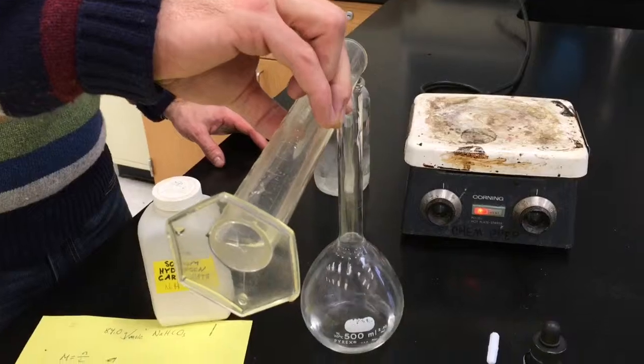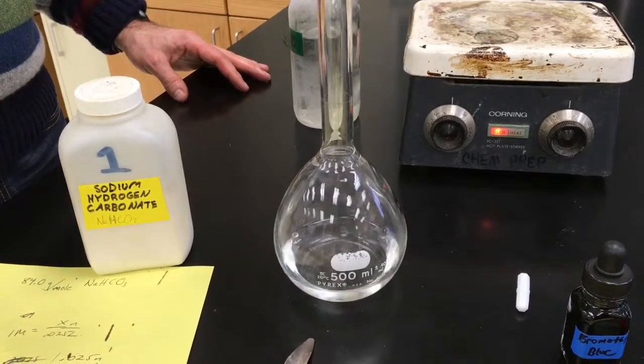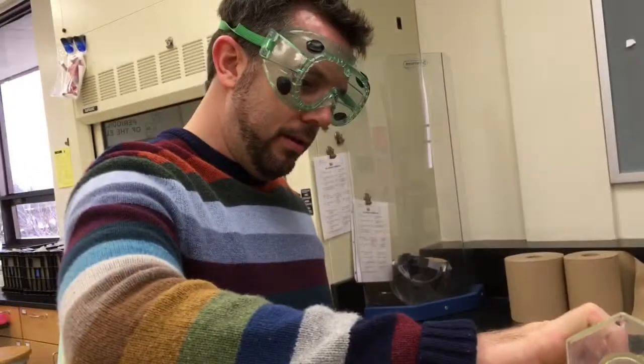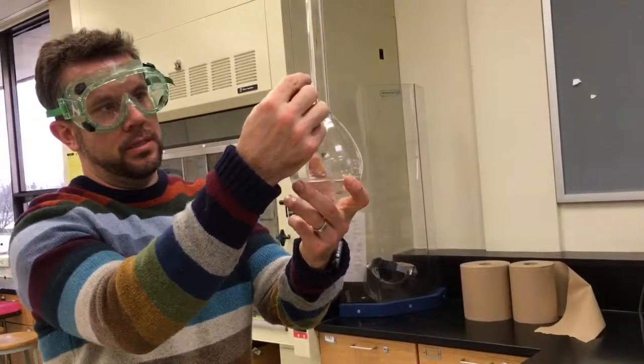Once again, you can see that it's kind of cool looking. It flows a little bit more viscous than water does. I don't know if you could tell though. But anyway, now this volumetric flask, what makes it so expensive is this marking on it.